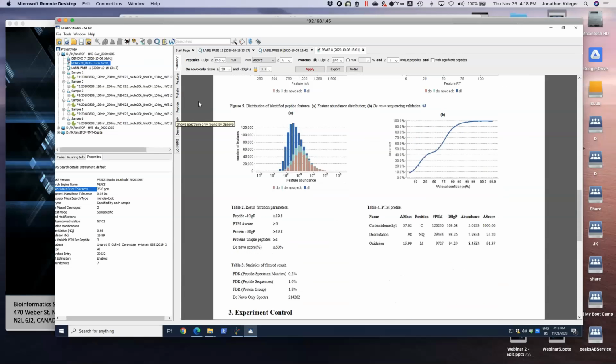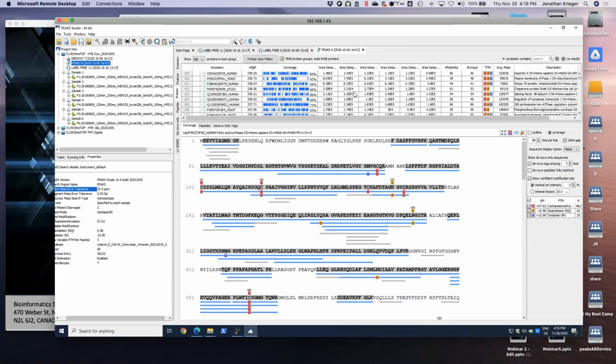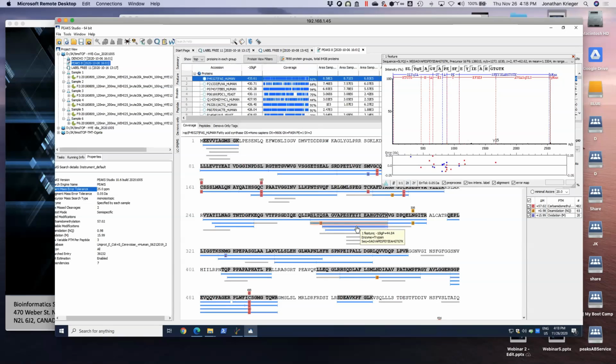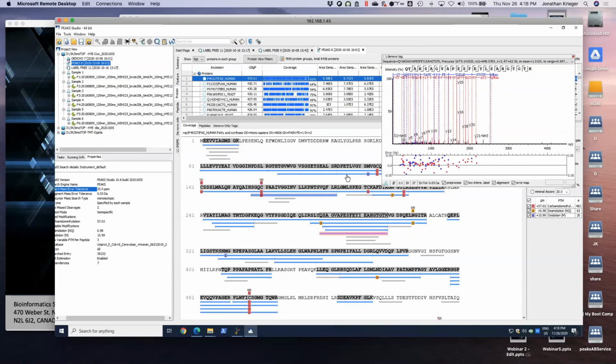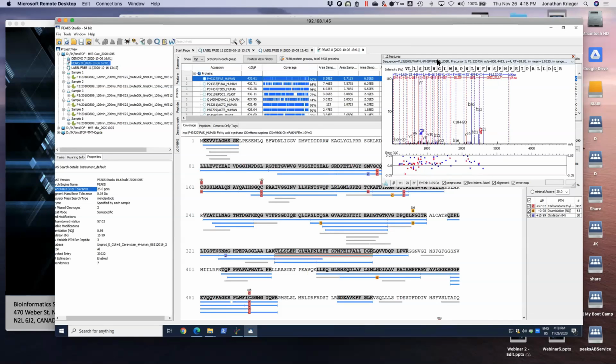And so, what does that look like when you look at the protein level? Again, just like any other data, and if you're a Studio user, you get your typical data set that you can see. Of course, each of these peptides can be clicked on and interrogated based on what the spectra look like. And if there are multiple features, let's see if I can find one like this one. Here there are 12 features that all correspond to this peptide.